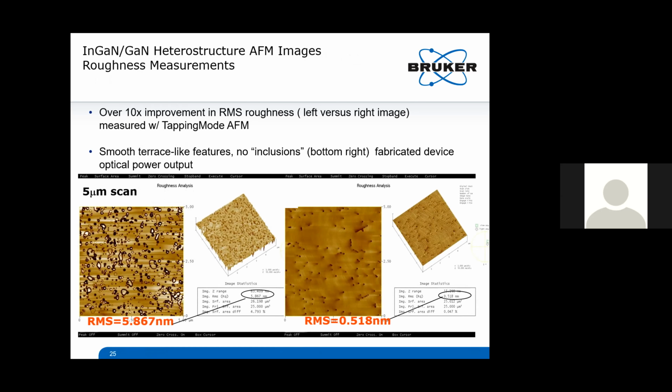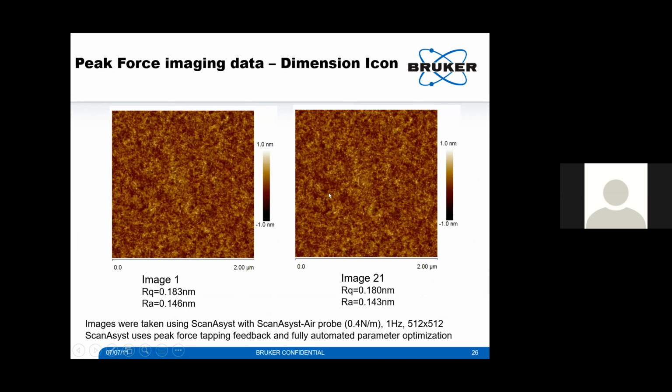It's just indium gallium nitride film, which was created by two different processes. And on one process, you get a lot of defects. You have a roughness of 5 nanometers RMS. With another process, those defects are gone. You see a few screw dislocations. You see atomic steps and an order of magnitude lower RMS. This is probably one of the most common uses of AFM. This is an old application article, actually, that we used tapping mode on. So this is very common.